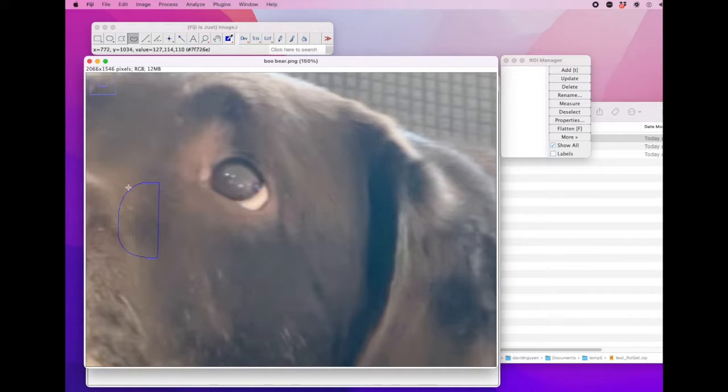So this kidney bean tool is very useful when you want to outline a shape that you also want to measure area for, because it completely closes the loop so that you can measure area reliably, right? Because otherwise, if you use, say here, a freehand draw tool, and I draw this and I let go, well, the shape is not closed. So if I try to measure the area of this shape, it's going to give you a really weird reading because Fiji doesn't know where the shape ends, and it gives you a measure that's meaningless. All right, so if you want to outline a shape that you want to measure the area for also, right, you want to use a closed shape tool.